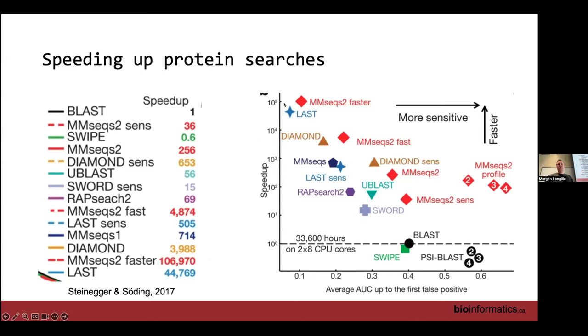Basically the idea is if you have a large gene, we're counting genes as units, right? So if we have a large gene, the probability of hitting it with a read when we sequence is higher than for a small gene. If the gene is 1,000 base pairs, and this other gene's 500 base pairs, and we're randomly sequencing, then we would expect to basically double count the 1,000 base pair gene compared to the smaller one. So what they'll do is take those numbers, they know what gene family was hit, they know the length of the real gene, and then they simply divide those counts by the length of that gene. So now you're normalizing for gene length. That makes sense to everyone?